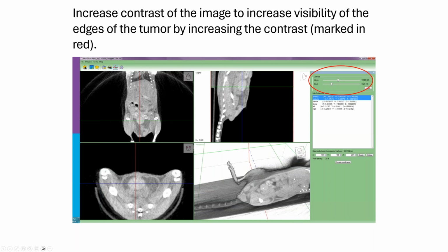And then obviously you can see some of the bone structure. You have the rib cage here, you have the spine here as well. And again, here's the prostate, and this is a normal prostate. Again, this is not a tumor. And then this is the bladder. So you want to have this so that you're able to really see these landmarks well, and you can adjust this through these different dials for black and white contrast. Okay, so that's the first thing that we do once we get our image in MiriPlan.